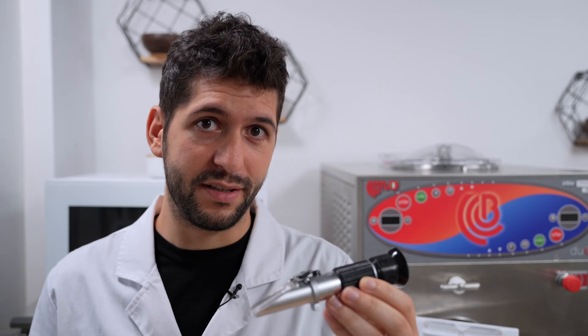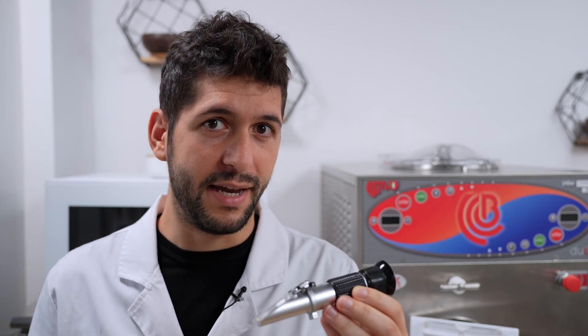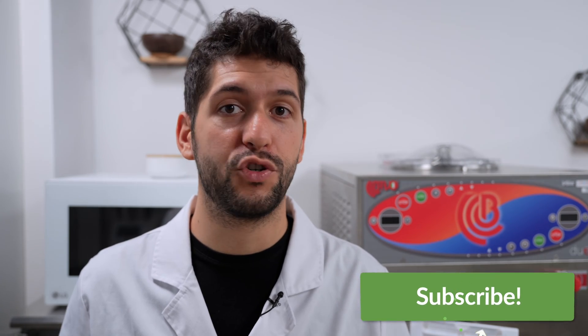If you want to make a sorbet with some delicious fruit like raspberries, you might have no idea how much sugar is inside your fruit. This is a refractometer and it can be very helpful in your lab to find out how much sugar is in your fruit and your mixes. I'm Luca Musolesi from Gelato Expert, and in this video I'm going to show you what refractometers are, how to use them, and how useful they can be for measuring sugars in fruit, sugar syrups, and other ingredients for your gelato or sorbet.